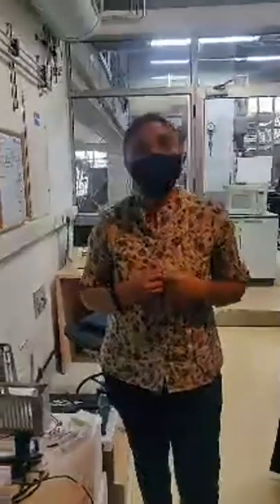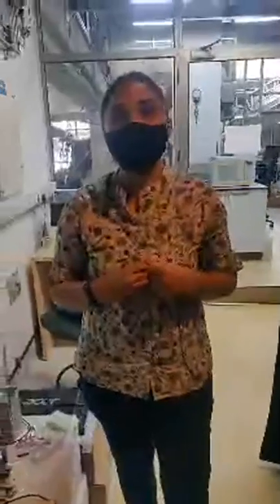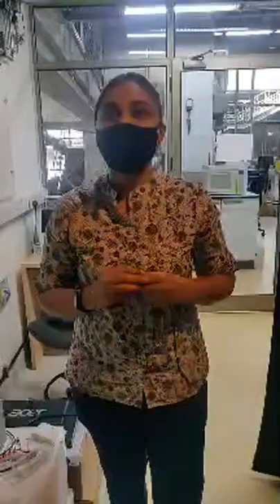So are human brain cells also similar to those of zebrafish? Yes, that's why we've chosen it. They're very close to the properties of these neurons, and the connections that they make. Okay. So now what you will see there is the population activity, the activity of many neurons instead of just one neuron. So right now we were studying one neuron, and now we are looking at multiple neurons, studying them together. Exactly. Or do you study them one by one and then club the data? You can do that also, but it's good if you can get activity from many neurons simultaneously.